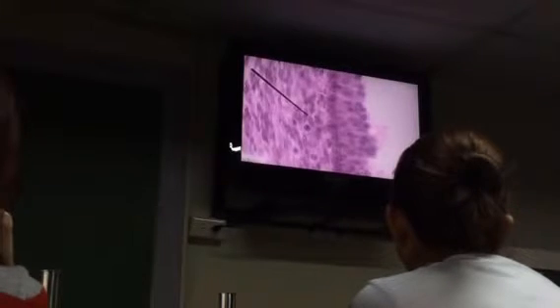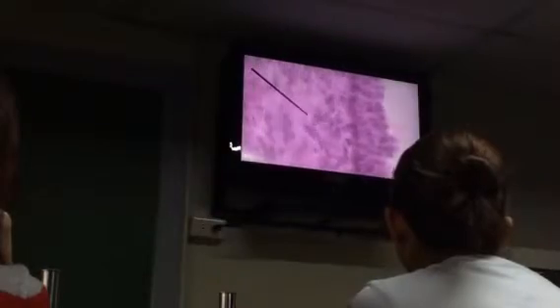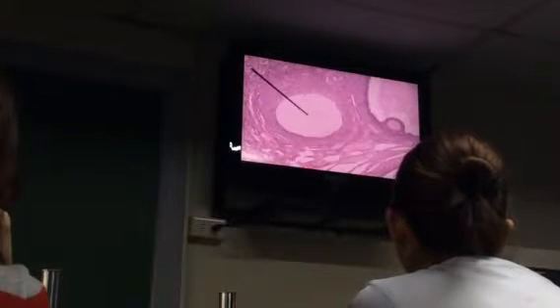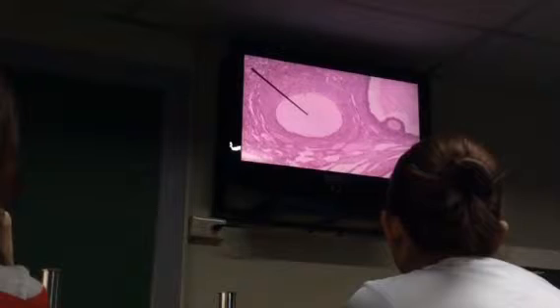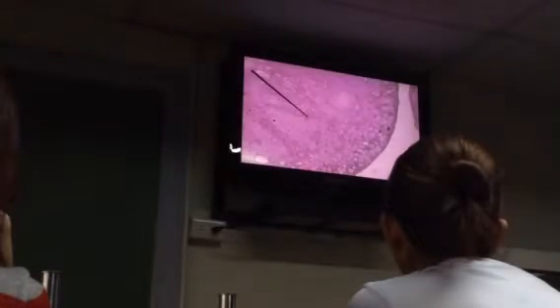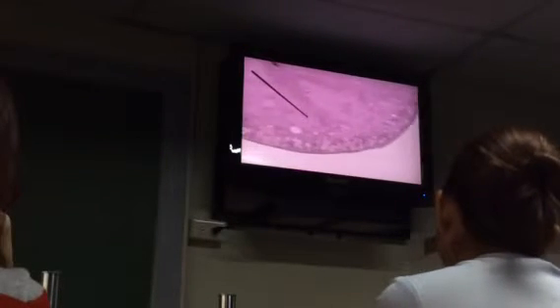Okay? So this is one of the things we'd like you to look for when you study your ovary. The other one I'd like you to look for, again turn back to low power, is your corpus luteum. So after ovulation, the housing of the follicle is now just the one remaining, and it's now turned into a corpus luteum, or a structure that looks like this, like a cloud formation, right? So look at that. So this is now your corpus luteum.